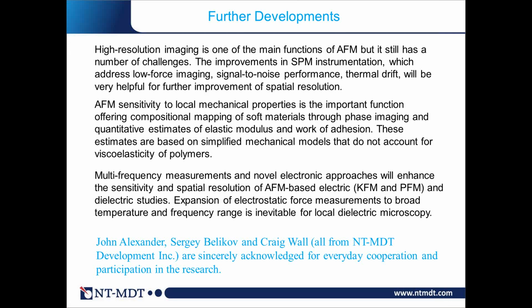Low force leads to blurry imaging. How can one change the distance on which the surface potential is measured in single pass Kelvin?